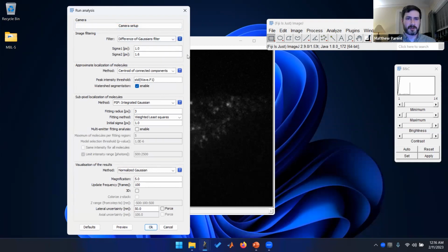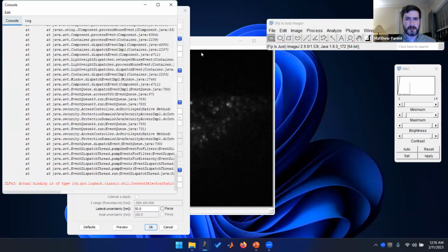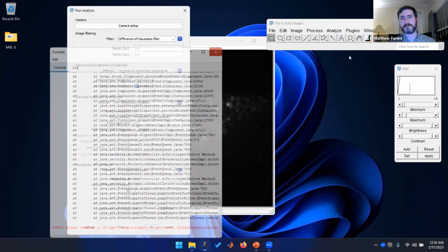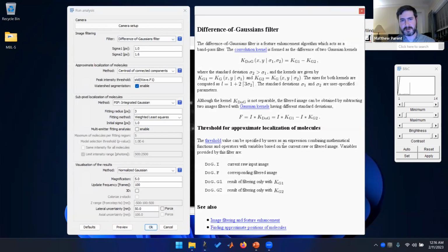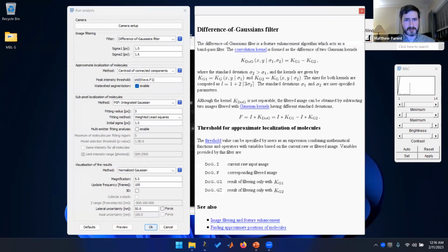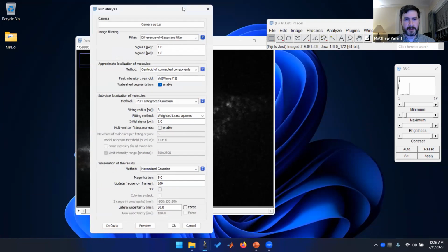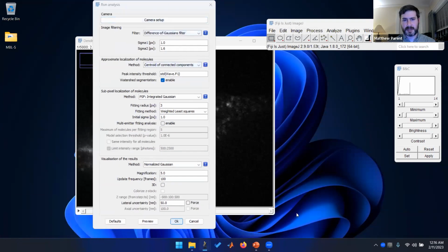And they also have these little question marks here. Oh, if it doesn't break. Let's try it again. There we go. And it'll tell you what each of these filters does. So this program is really good about that. And okay, so let's choose that.